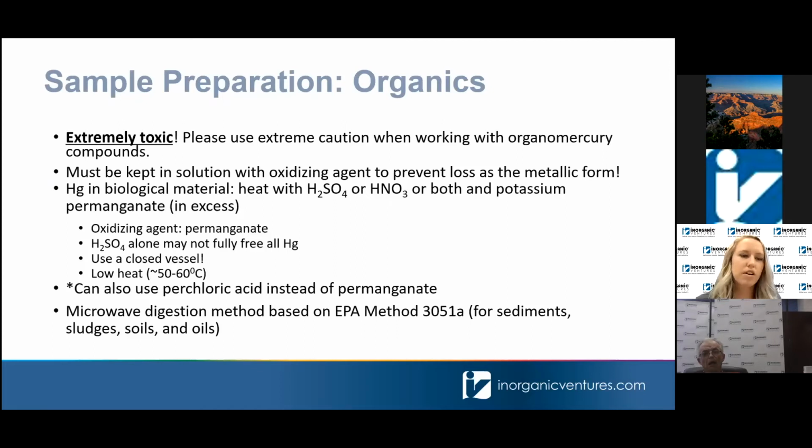So I just want to start off by saying that any organic mercury compounds are going to be extremely toxic. That's one of the reasons that we don't work with organomercury compounds here, just for the safety concerns. So if you are working with these, just make sure that you're using extreme caution and operating under proper safety measures.